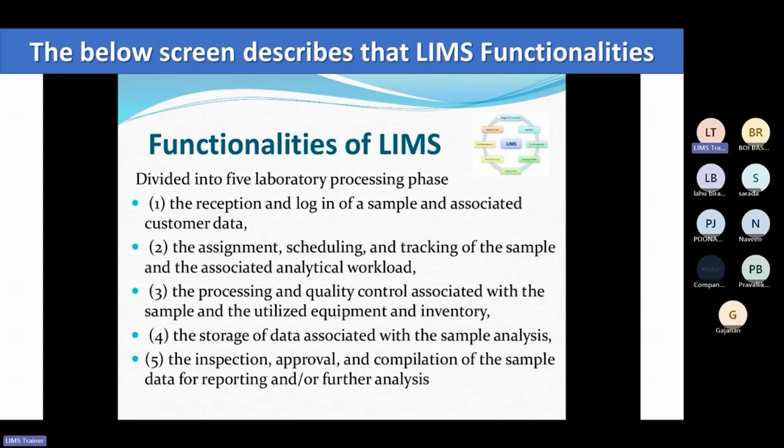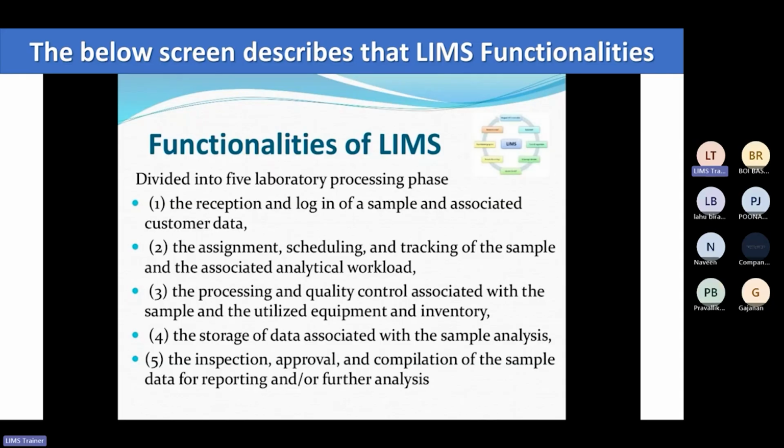The storage of data associated with the sample analysis, whatever data is generated with that particular sample, the storage and handling of that data, and also the accuracy and privacy of the data, that is the functionality of the LIMS. Then comes the inspection, approval, and compilation of the sample data, and reporting also for further analysis. If it is required as a reference for further analysis, that is also provided by the software.